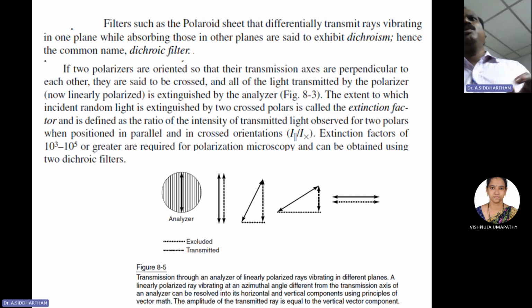A material which tries to separate the polarized light into two different varieties or two different paths, we call a birefringent crystal. Naturally, a material may have one axis, and after refraction, the ordinary ray goes with the same velocity in one direction, and an extraordinary ray goes faster compared to the other ray. That vibration front we call the extraordinary ray.